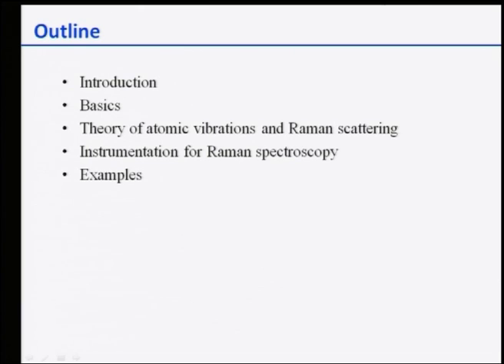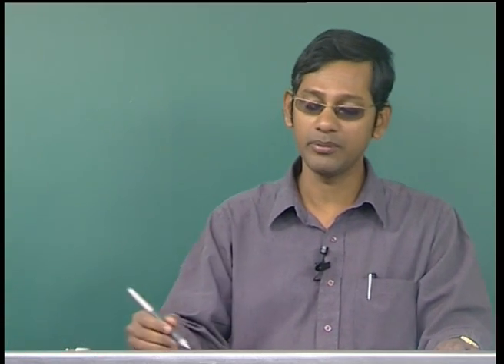But I am going to give you some basic idea of the spectroscopic technique, how it can be related to applications, and obviously some amount of instrumentation will be dealt with. As you know, the outline is like this. There will be an introduction going back to history and some basic features, and then I will talk about some basics of Raman spectroscopy, covering theories and some amount of scattering and vibrations, and finally some instrumentation for Raman spectroscopy. During the course of the lecture, I am going to talk about some examples from the literature and from some of our own work.